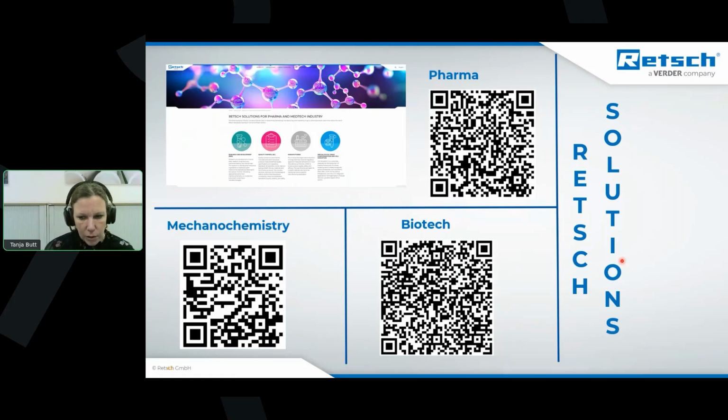When you mix the sample with talcum and then put it into the ultracentrifugal mill, then you have the particles separated because the fat is absorbed. This can also help. Or using distance sieves, for example, so that you do not warm it that much and you do not squeeze out the fat of the particle that much because you reduce the shearing effects in the machine. So there are some tricks also to reduce the stickiness of fatty particles as well.